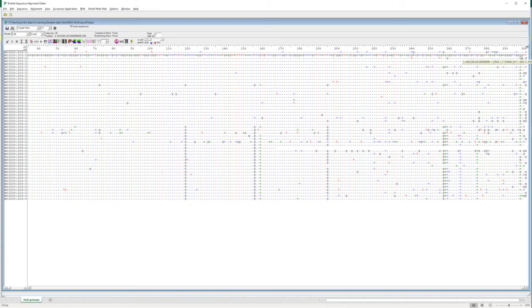until we get to this position here, 4 bases from the end. And when we get to this position, 4 bases from the end, we see this one has a C, and there's a few other reads that also have a C, and there's quite a few reads that have an A, and then there's a few reads which have a G. So basically this is a position where it's difficult to be 100% sure what the consensus should be. And again, fortuitously for us, it's only 4 bases from the end, so I think that we'll just end our consensus sequence at that position.